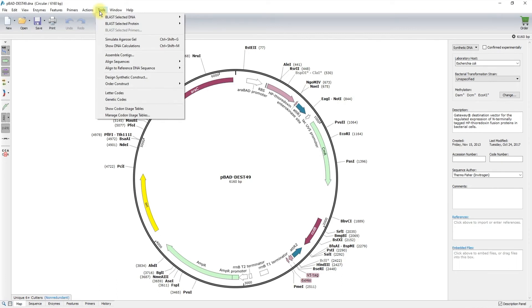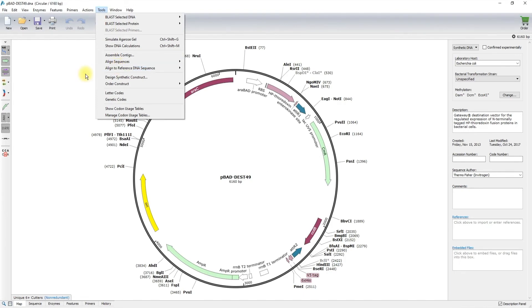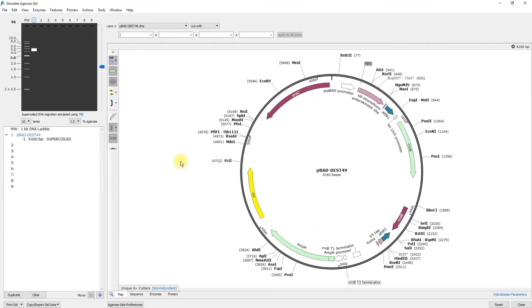The best way to verify a clone is to sequence relevant regions and compare the actual sequence to your simulated DNA sequence. For this purpose, you would use the align-to-reference DNA sequence. During the course of your experiment, you may also choose to analyze your clones with a diagnostic PCR reaction or restriction digest. For this purpose, you can use the Simulate Agros gel tool to predict your results.